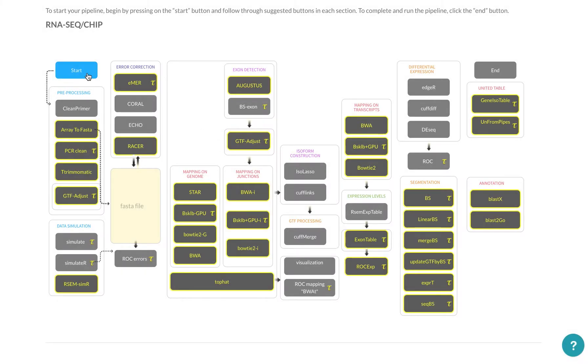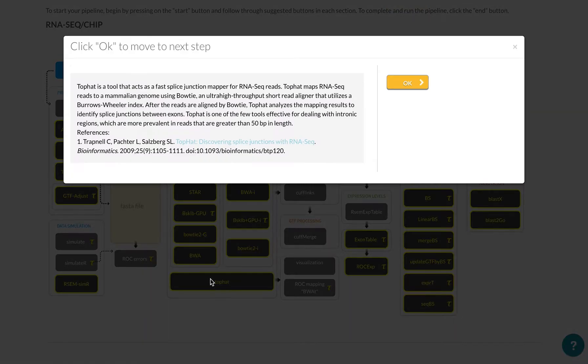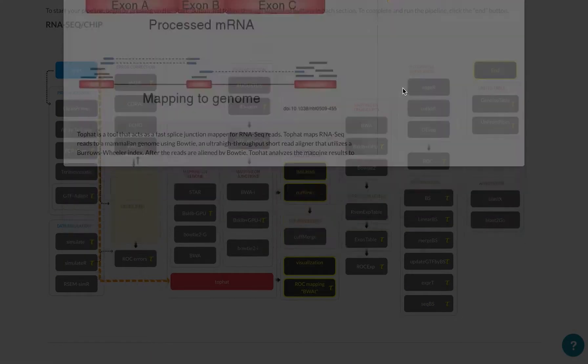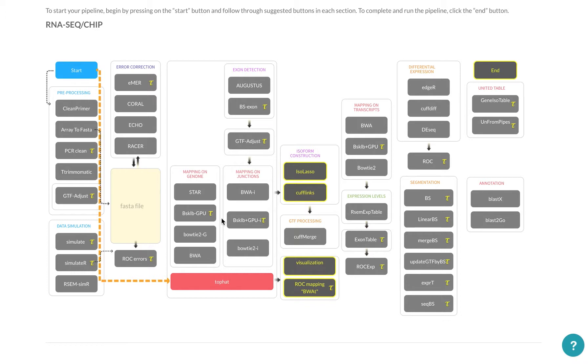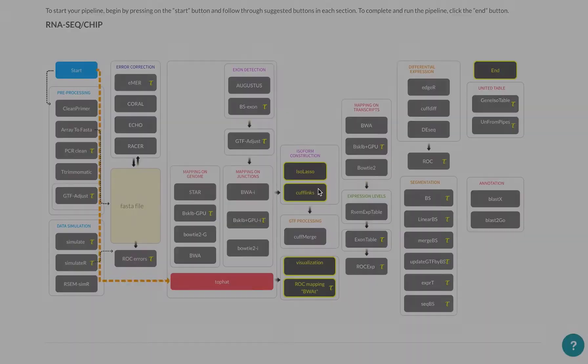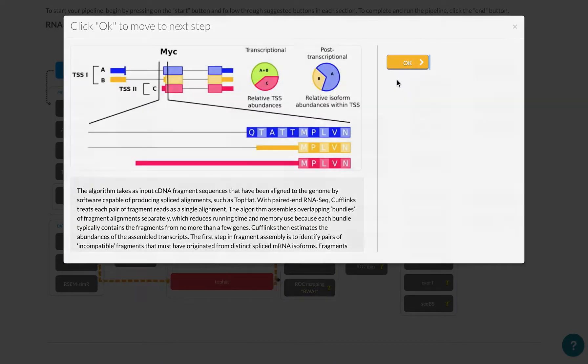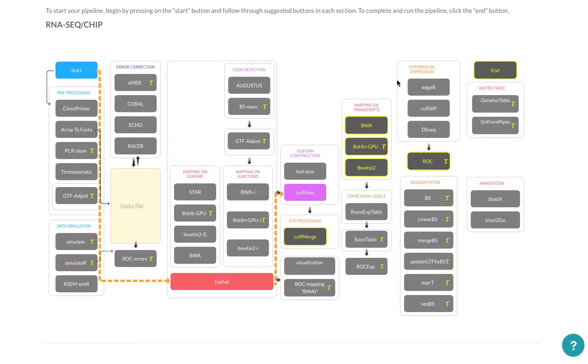And then we can use Cufflinks to do isoform construction. And then we can use Bowtie to, or sorry, we can cancel.